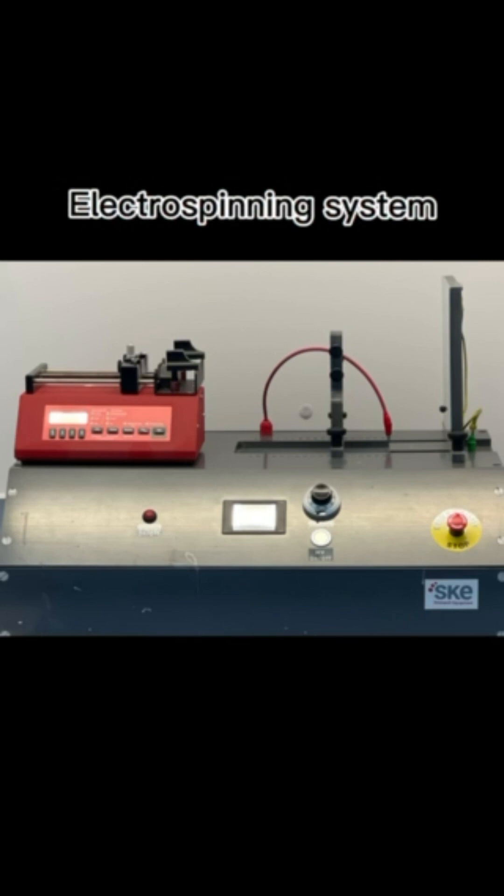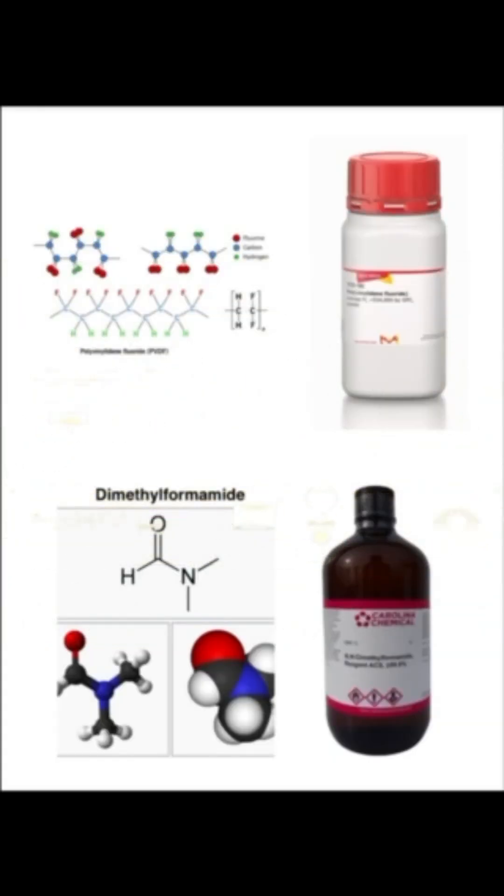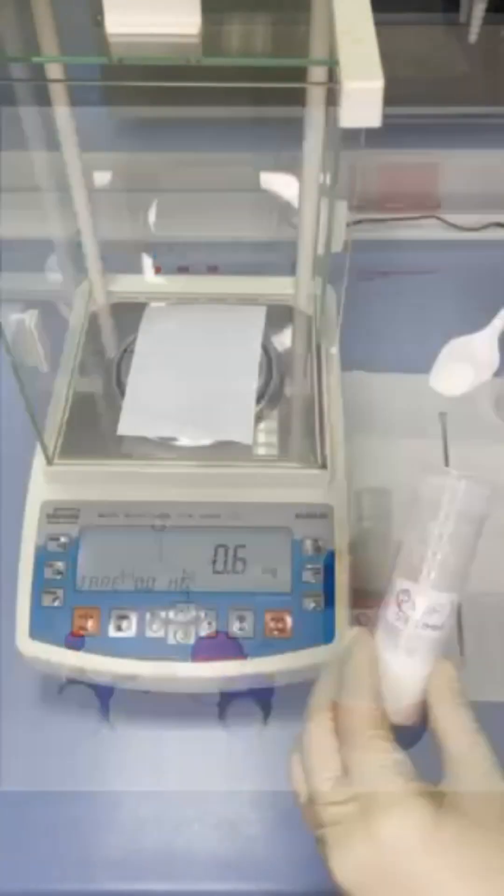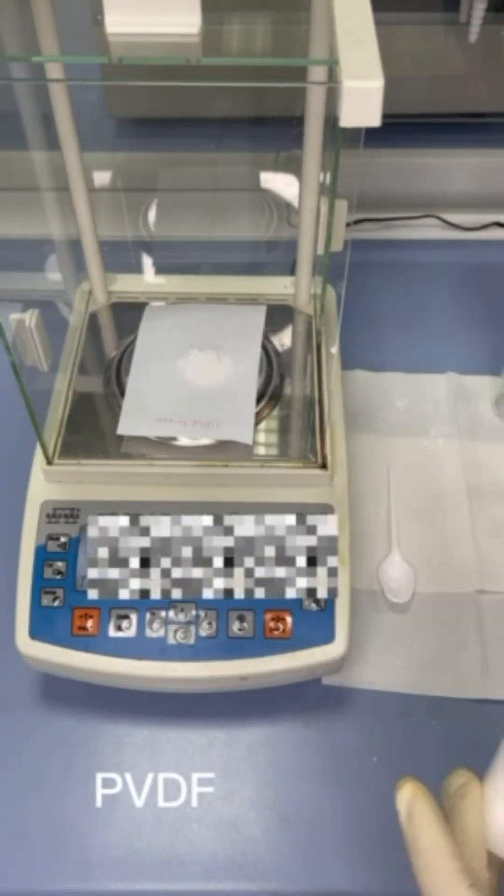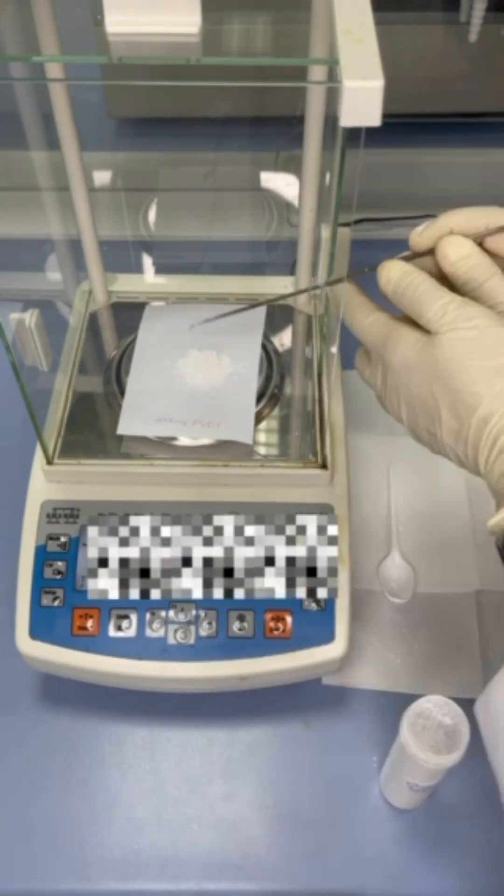In this video we will talk about how we make membrane with electrospinning system. We will use the polymer PVDF with some fillers, graphene or carbon, and the solvent DMF. I will start the procedure with the polymer, the filler which is carbon, and the solvent.